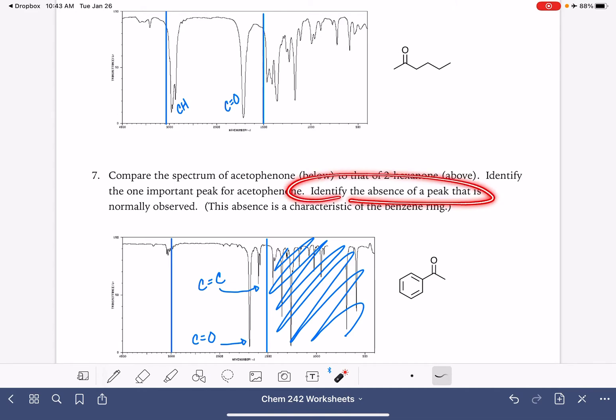Identify the absence of a peak that's normally observed. Well, that's going to be our carbon hydrogen peak. So in this case, we're missing our carbon hydrogen peak, not really missing it because there it is. It's just really, really stubby short. And this is a characteristic of a benzene ring. So a molecule that does not have very many carbon hydrogen bonds aside from the ones that are on a benzene ring, like this molecule right here just has a one CH3 group. We're going to see a lot of stunting in the normal CH area. So when we're looking at a molecule and we see, whoa, we're missing our carbon hydrogen peaks, this usually lets us know that we have a benzene ring present.